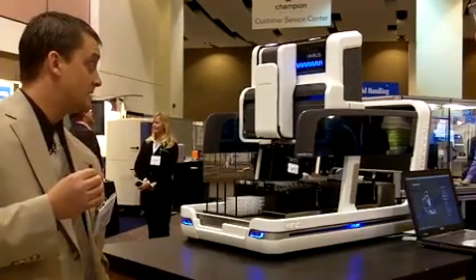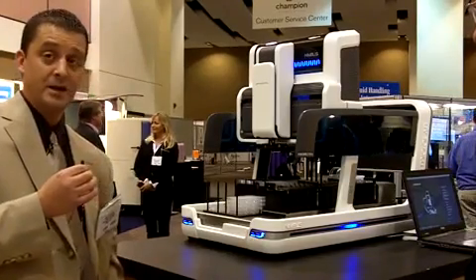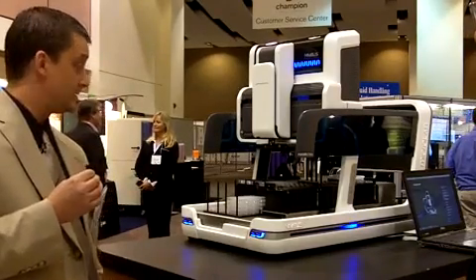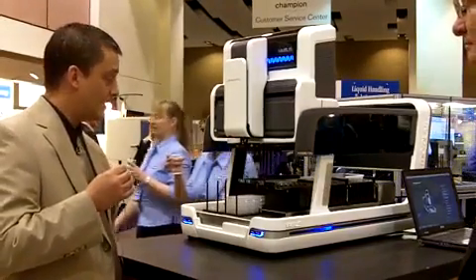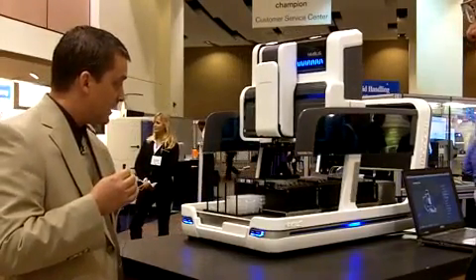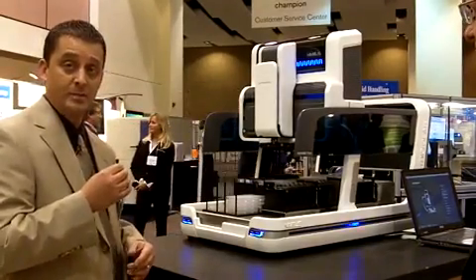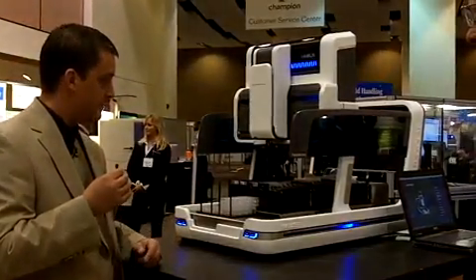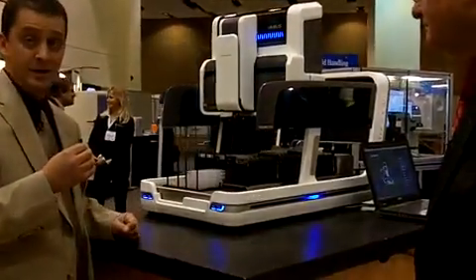This is our latest addition, the Nimbus iProbe. It has four independent channels — these are 1ML channels that have flexible spacing, independent pipetting control, and also an integrated labware gripper for integrating to third-party peripheral devices off the deck. This particular configuration also has a barcode scanner integrated onto it.